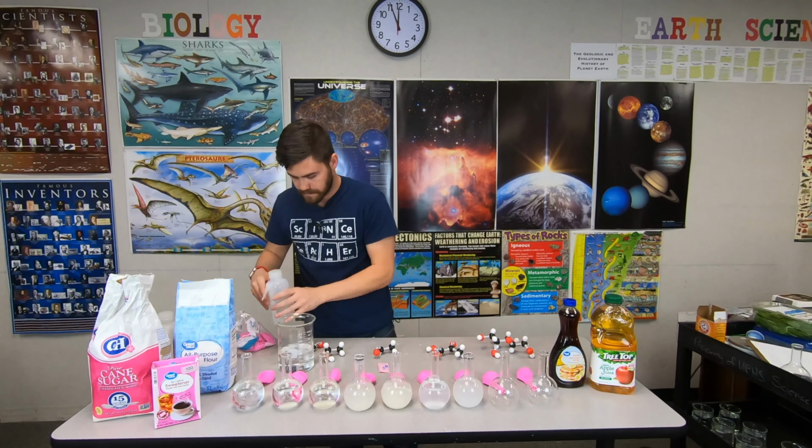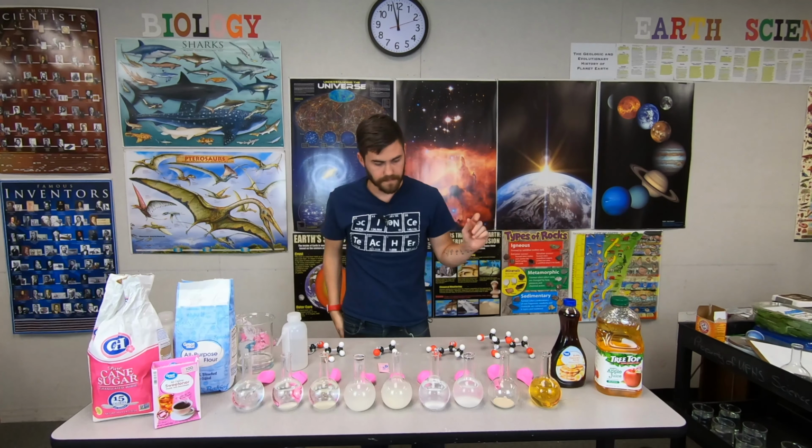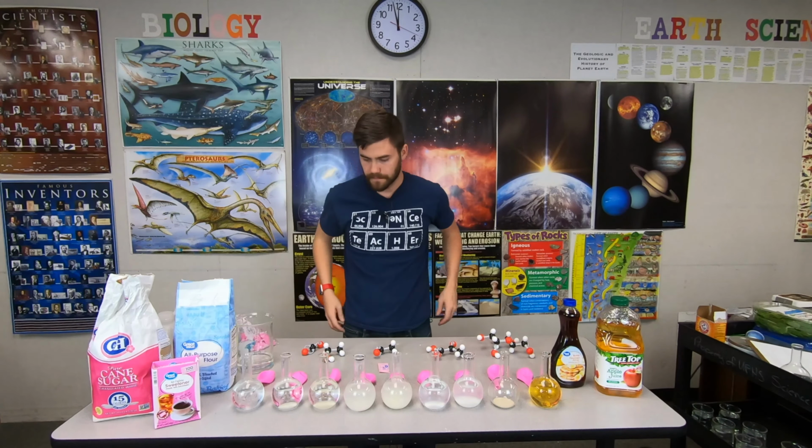I'm going to dump the yeast in this flask first because the yeast will not be able to sink into the syrup otherwise. Before we move on, what we want to do is try to, as best we can, dissolve the carbohydrates, these are not carbohydrates, but dissolve them into the water as best we can so that the yeast have full access to those carbohydrates.